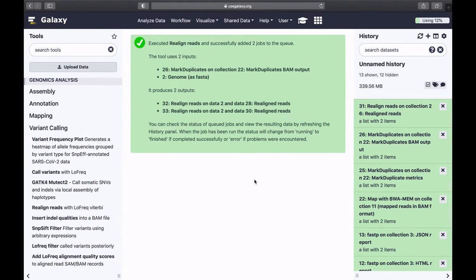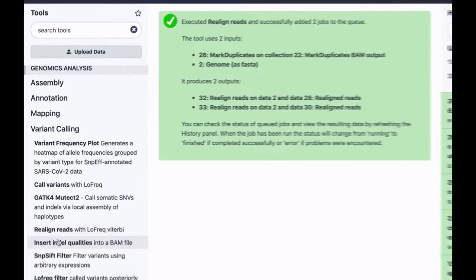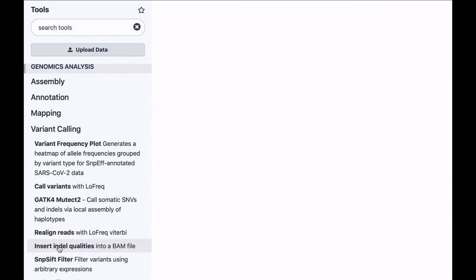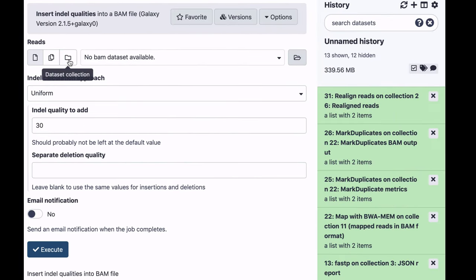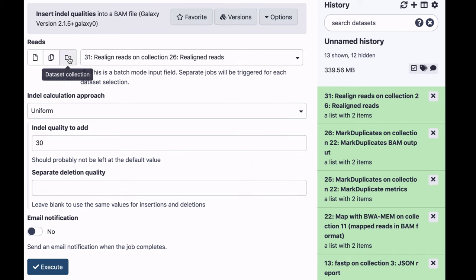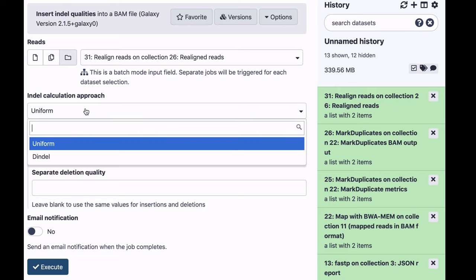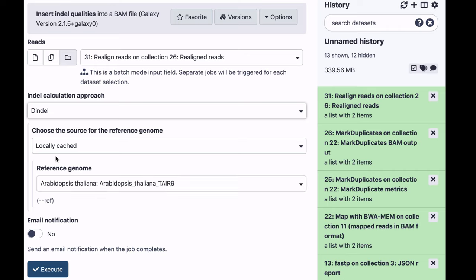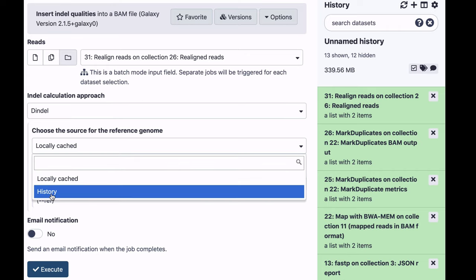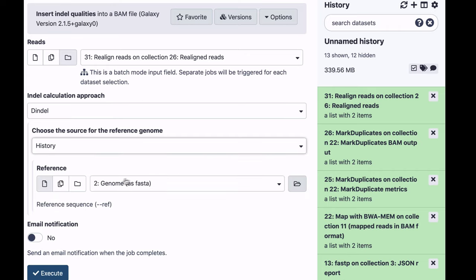The next step is to insert indel qualities. This is required to be able to call indels. Again, we are using collection as an input. This time, this is collection produced by realigned reads. We're going to use the indel approach, and that requires reference genome again. So we're going to select our reference from history and run it.